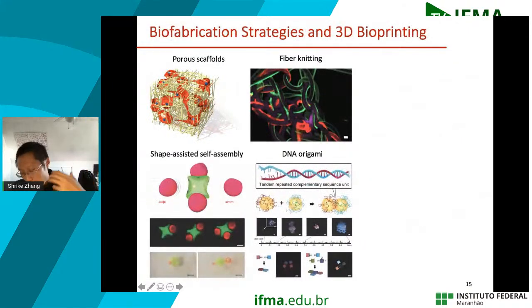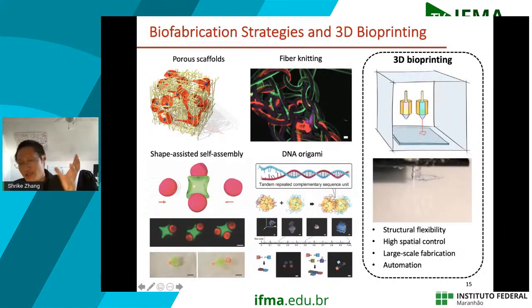So with that in mind, there have been many conventional biofabrication approaches, for example, based on scaffolds. But the issue with those is that they are usually based on manual or semi-manual operations. Meaning that if you're trying to make one copy, that's okay. If you want to make tens or hundreds of copies, that can be labor intensive, and reproducibility is going to be low, right? So that's why in the past 10, 15 years, probably more like 10 years, people have been really trying to work on these bioprinting methods to allow automated control of patterning of cells and ECM molecules in a nice spatial way, right?